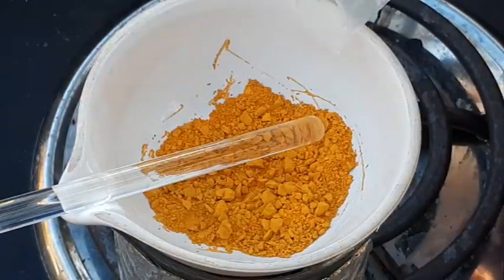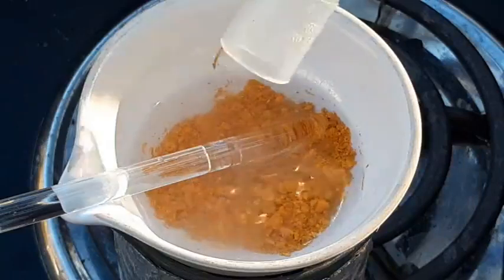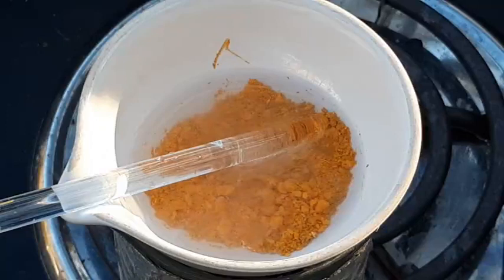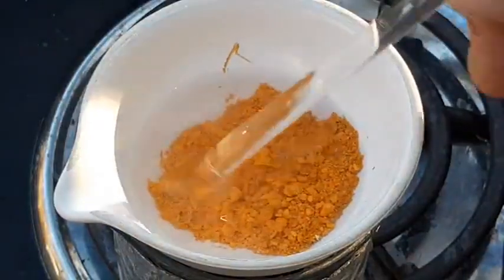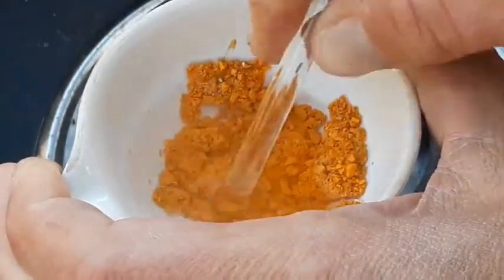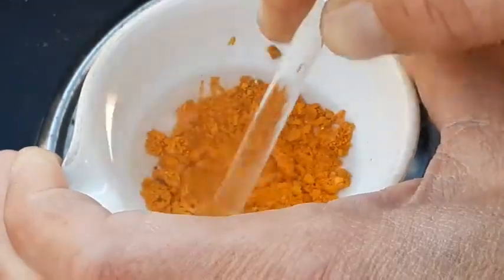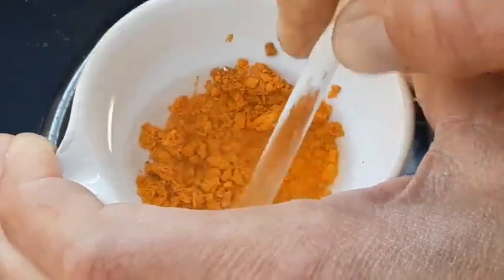I am going to add the acid to this. Okay, a little bit of bubbling. Whoa — it turned into a giant solid mass there for a second. That's interesting. I'm not really sure what's up with that.